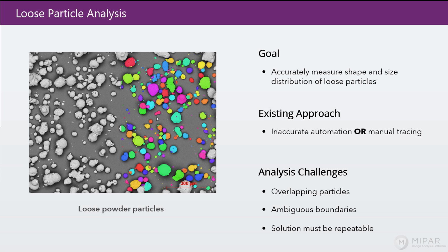In this application, we look at quantifying particle size in an extremely challenging condition. In this case, as mentioned in the introduction, we see a number of challenges. The first involves particles sitting on top of one another. In some cases, these are legitimate satellite particles. In other cases, they're simply static adhered and are not actually chemically bonded, but nonetheless, they still need to be accurately identified as separate from what they're sitting on top of in order to get an accurate size distribution.